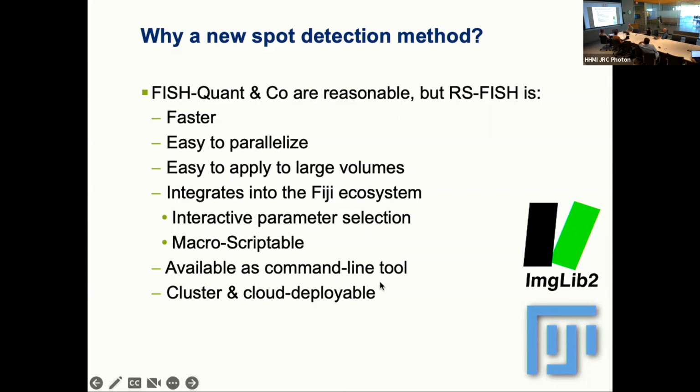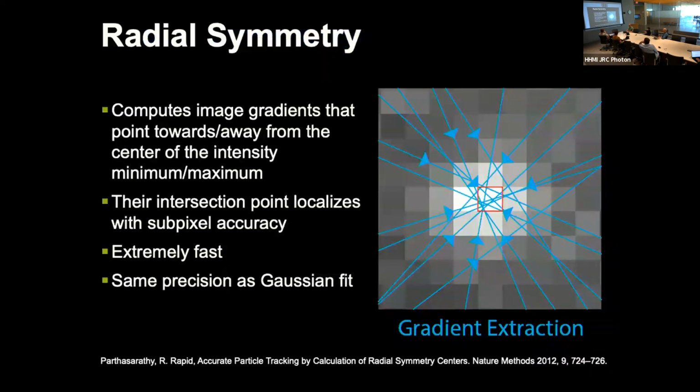Microscopy, a command line tool, and, at the end, we also made a cloud-deployable software package of this. I'm not sure people actually use it because it's not so common, but you can. So from the computational side, that was the original idea from Tim and myself.